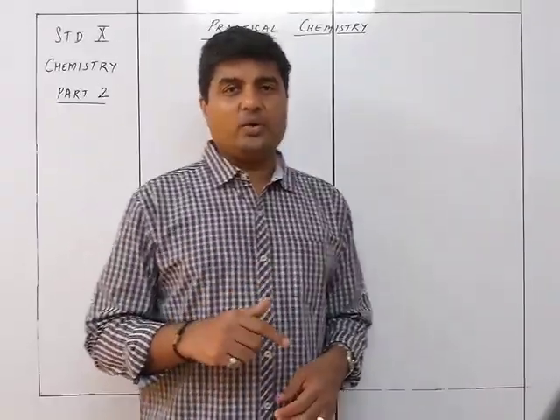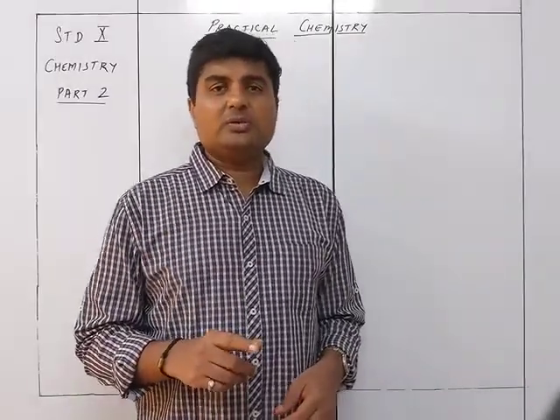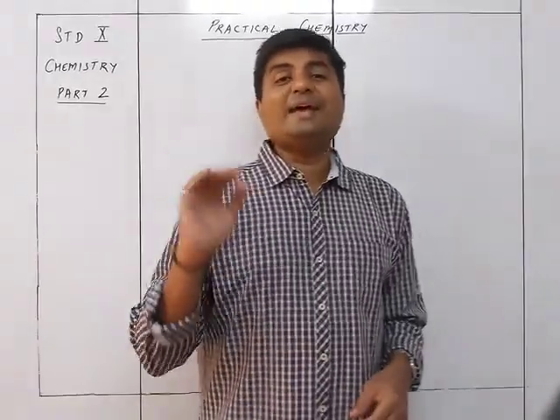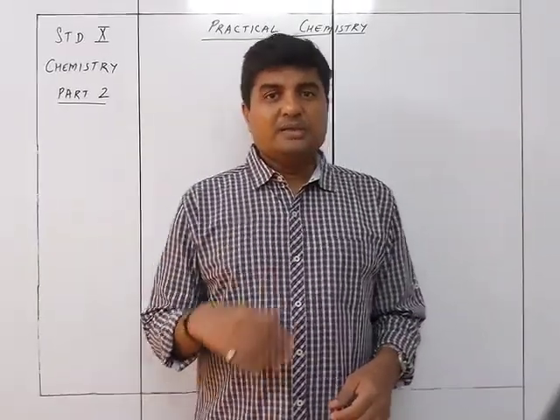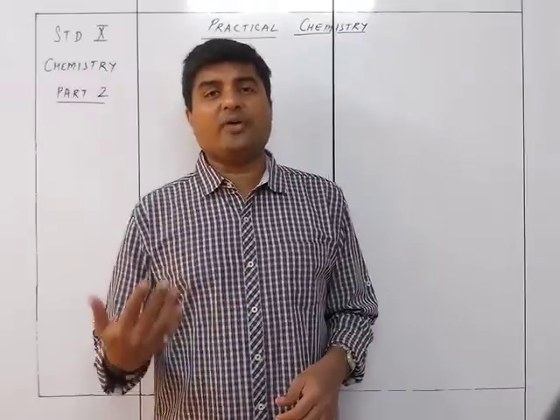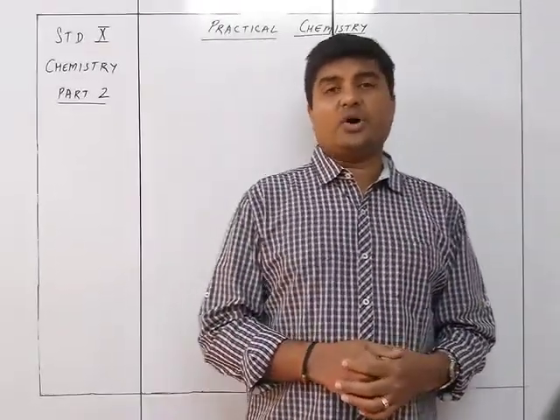One is a test with NaOH, another will be with NH4OH. Why is that so? Because in case of NaOH, it is soluble in excess, but in case of NH4OH, lead is insoluble in excess, and that becomes a differentiating part between zinc and lead. Zinc hydroxide is soluble in excess of NH4OH, whereas lead hydroxide is not soluble in excess of NH4OH.